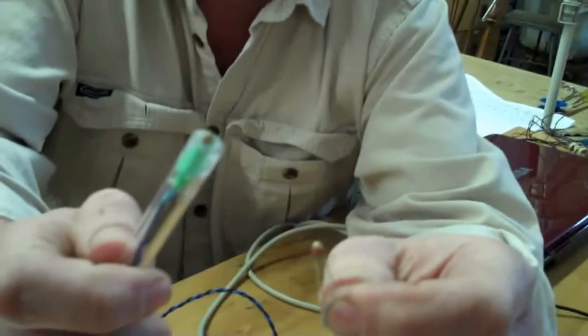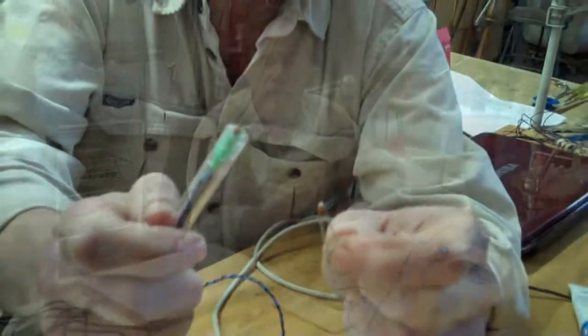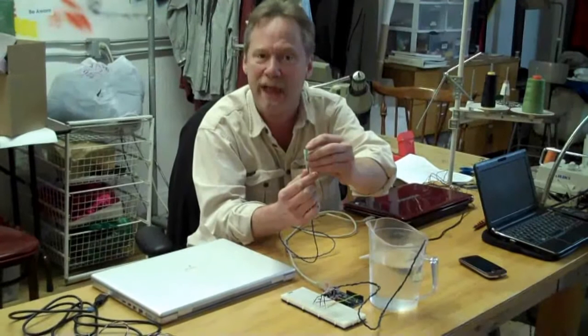Here's what it looks like once we've mounted it in a waterproof probe. We've attached our wires to it, used a piece of acrylic tubing, and filled the space in between with silicone aquarium cement. We've got our thermistor poking out just a little bit here for a rapid thermal response time.